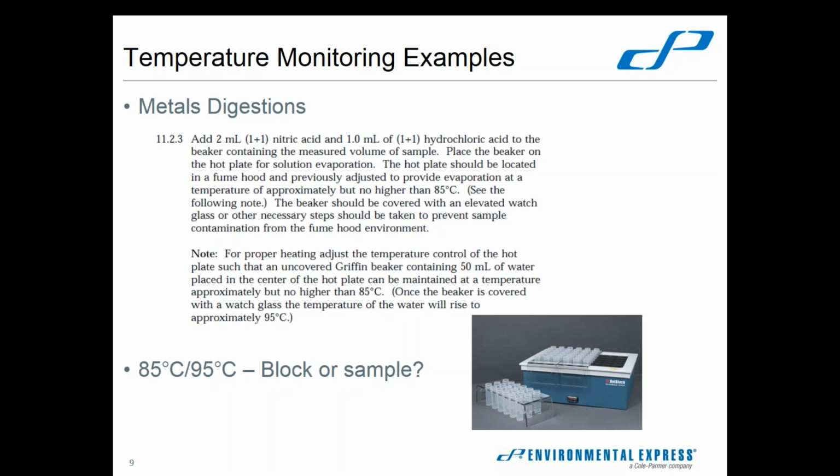And it all varies depending on the contact efficiency and the heat transfer efficiency. There are some coefficients involved in all this. It's a fun problem if you have all the proper equations and all the proper data, but there is actual heat loss. And so you actually need to set your heat source higher than what your sample temperature needs to be in this particular case.